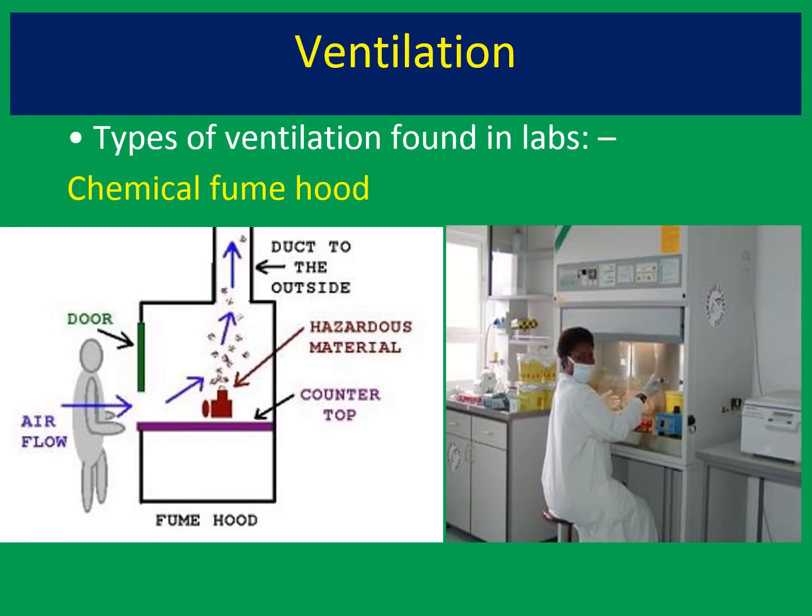And the ventilation. We have one fume hood in the analytical chemistry lab, so you can go there and see how it is working. Why are we always recommended to use this fume hood? Because you can see the airflow, right? Airflow is going from this direction. Since air is sucked in this direction to the outside, all the gases or whatever is produced inside the fume hood will go to the outside, right?